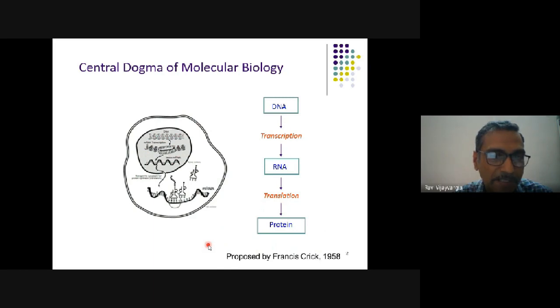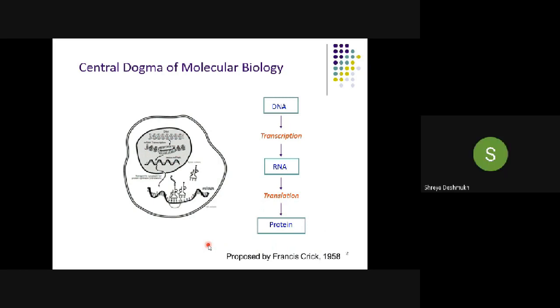By recombinant DNA technology, you can overexpress your protein of interest. Have you heard of this term, recombinant DNA technology? Yes, sir.